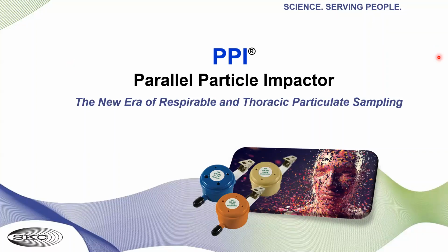All right. So thank you all for joining. I'm excited to discuss the PPI with you, the new era of respirable and thoracic particulate sampling. This is meant, of course, to be a product demonstration, but I intend to explain several other aspects of the why and how as it pertains to particulate sampling, and also how the PPI can help you be more productive and efficient in your demanding world of respirable and thoracic sampling.